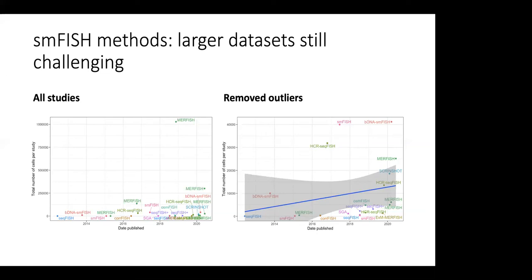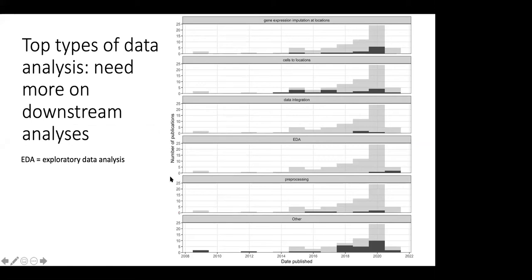Because for the single-cell resolution spatial methods, there are many challenges. For instance, you have terabytes of imaging data, but there isn't an image processing pipeline designed for these methods that is efficient enough or universal enough. And that's one reason. Another reason might be that the probes needed to profile so many genes can get quite expensive. And so these are about data.